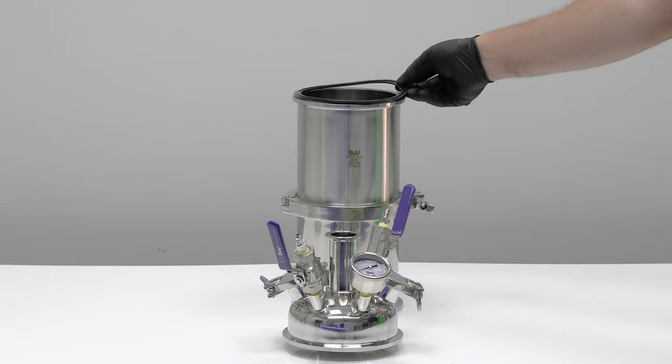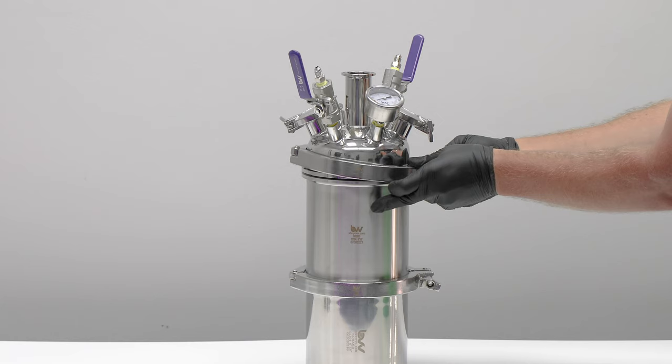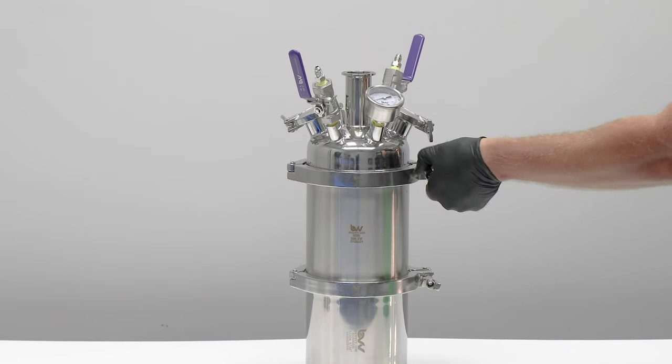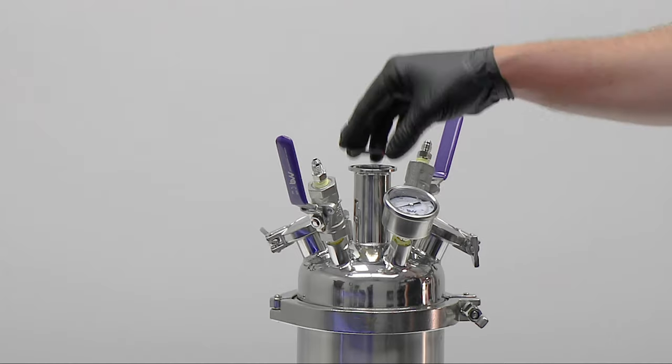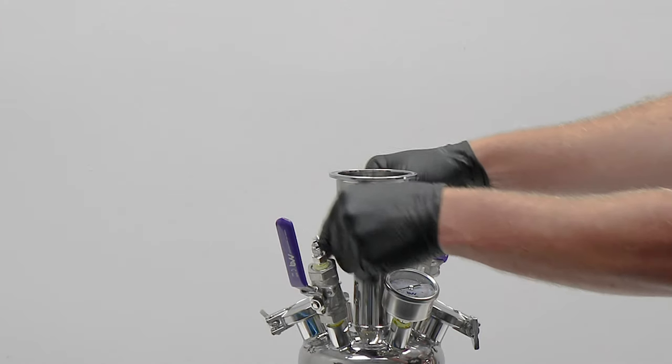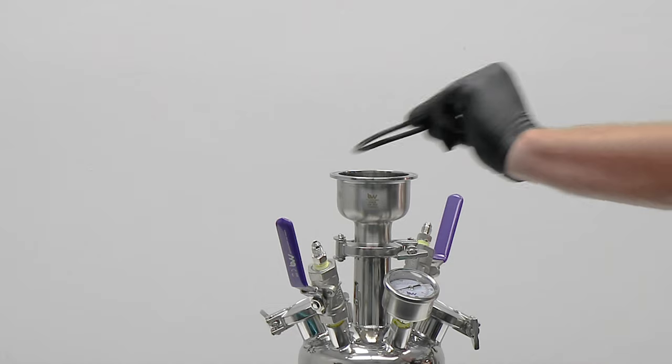Place the hemispherical lid on top of the extractor base. Secure with a single pin clamp. Put the mesh gasket on top of the extractor base and attach the hemispherical reducer to the column.